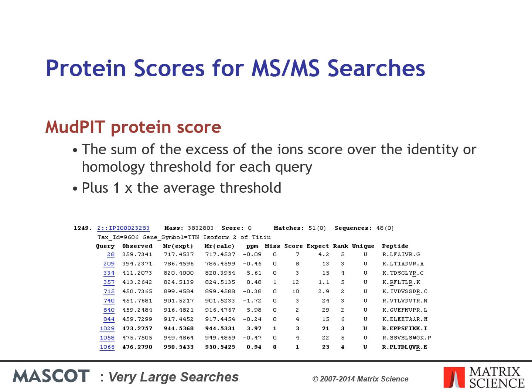By default, Mudpit protein scoring is used when the ratio between the number of queries and the number of database entries after any taxonomy filtering exceeds 0.001. This default switching point can be moved by changing the value of Mudpit switch in mascot.dat. You can also switch between the two scoring methods by using the format controls at the top of the report.